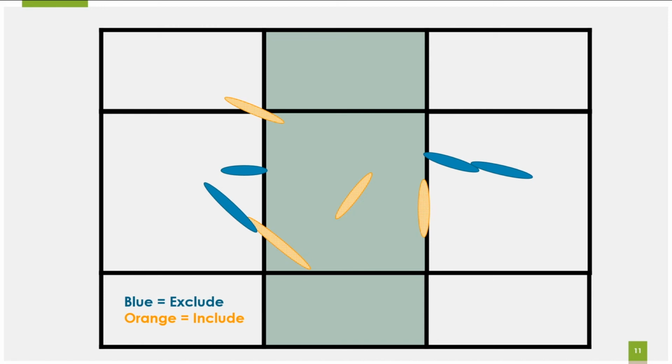Some of this is going to be analyst discretion, and a lot of you are new to this kind of counting method and just cell identification in general, so it might take you a few tries to say, okay, I can't really tell if that's in or out. Ultimately, I would say if you're really not sure about one cell, just go with a more conservative approach and say, okay, that's probably in the column. That's usually how I would do things if I really don't know.